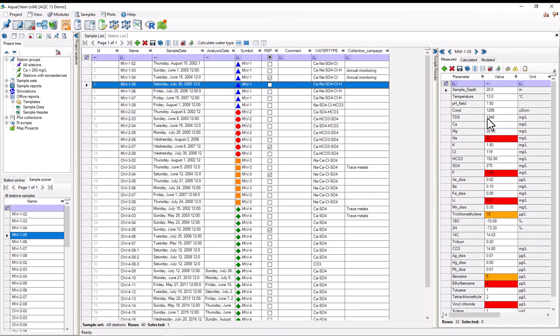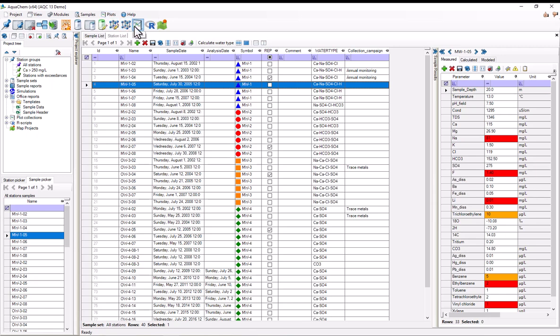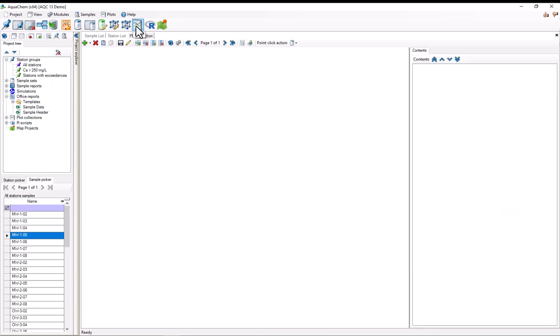Now to create a Piper plot, I first need to create a new plot collection. This can be done by going to the Plots menu and selecting New Plot Collection, or by pressing the Plots button on the Module toolbar.